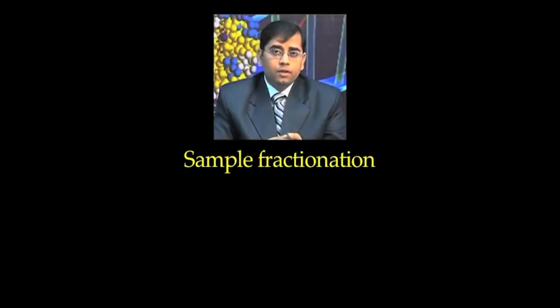Now, let us talk about sample fractionation. As I mentioned in the beginning, depending upon your applications, you need to decide on a strategy, an effective way of obtaining all the proteins, so that you can study your biological problem in an effective way. For example, if you are doing a proteome analysis for a particular organelle, then you need to fractionate your sample.